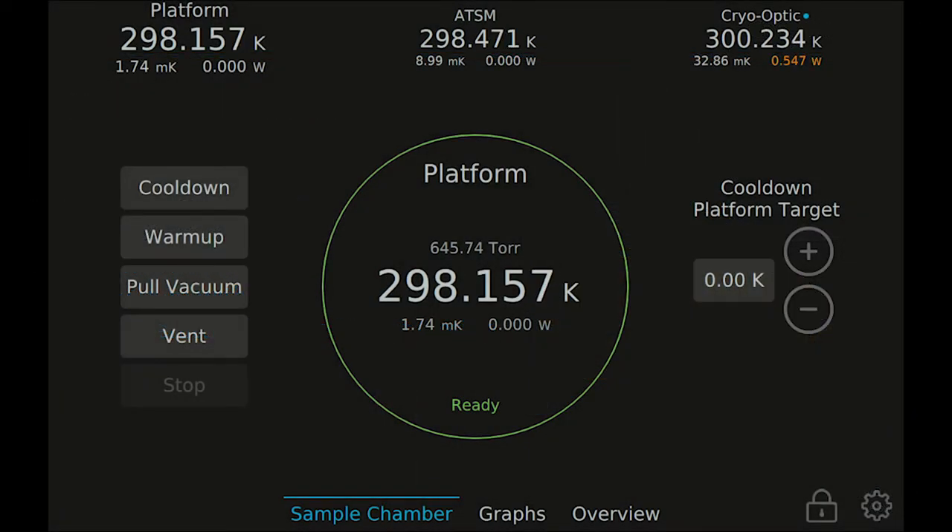To get started, make sure you are on the main operate view for the sample chamber and have the platform temperature channel selected. After you've loaded your sample and put the lid on the sample chamber, set the platform target temperature to your desired setting. The target temperature can be adjusted at any time during the cool-down process. For best performance of the ATSM, set the platform target temperature to zero to get maximum cooling power. The platform target will be left at zero for the duration of the cool-down and we will use the ATSM to precisely control the sample temperature.